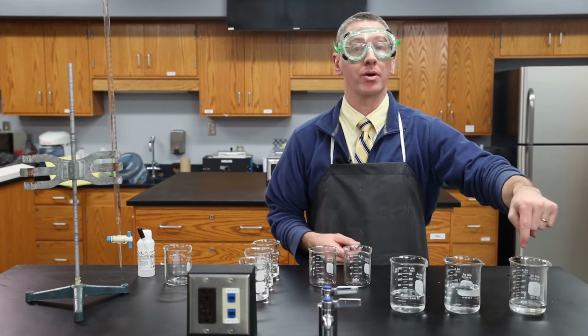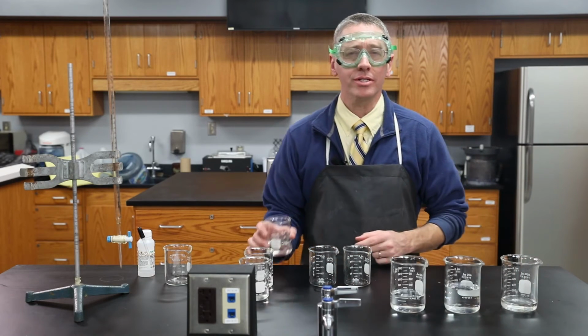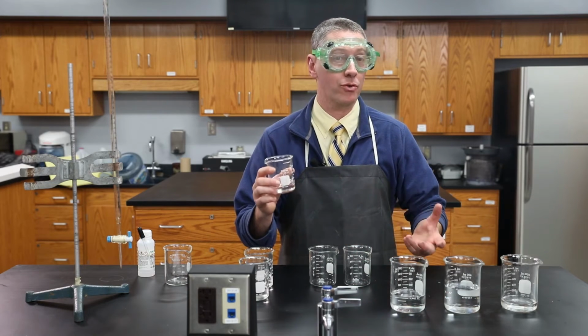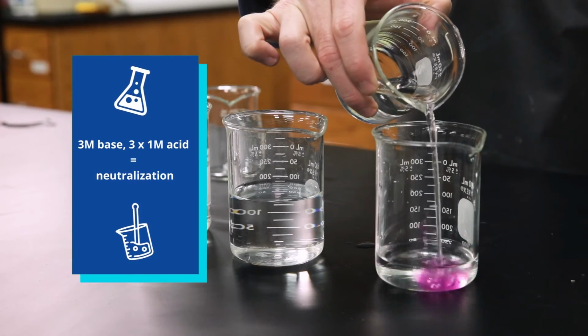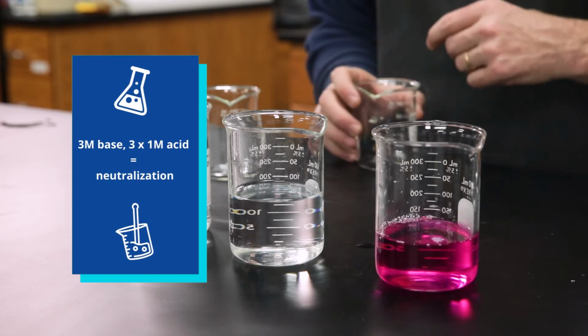Now we're at 3 molarity. So there's 3 amounts of OH minus here, and we're going to use the same 1 molarity acid. So how much are we going to need? Will it take 1 beaker, 2 beakers, or 3 beakers worth? So here goes the first beaker. Remember, the color change is purple when it's a base, so we have not neutralized it yet.